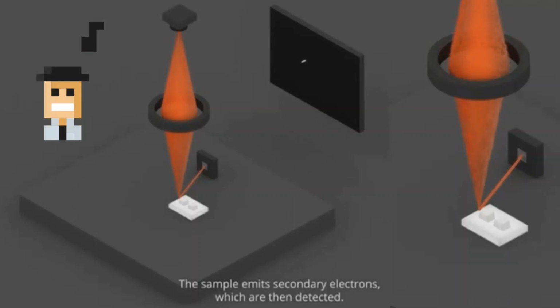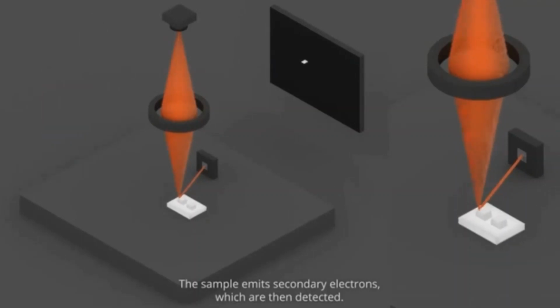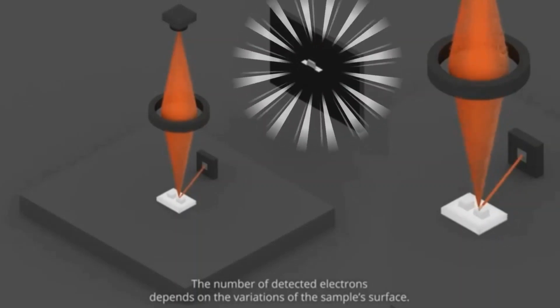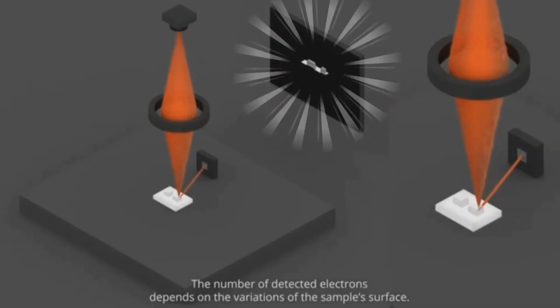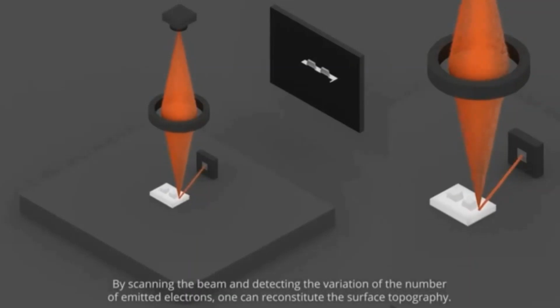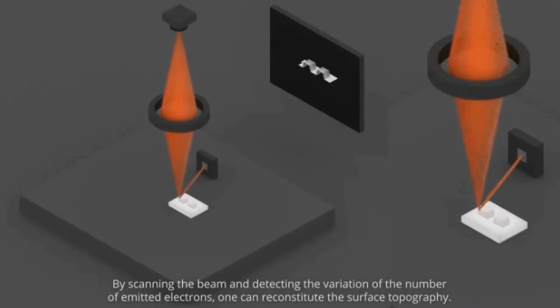The sample emits secondary electrons which are then detected. The number of detected electrons depends on the variation of the sample surface.